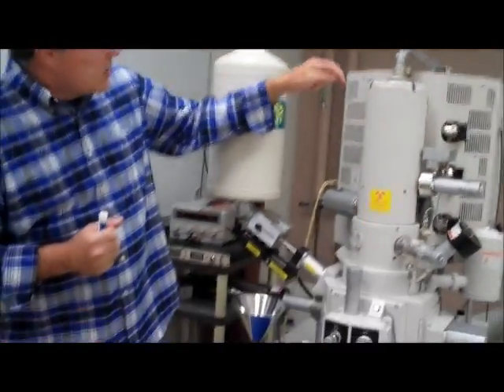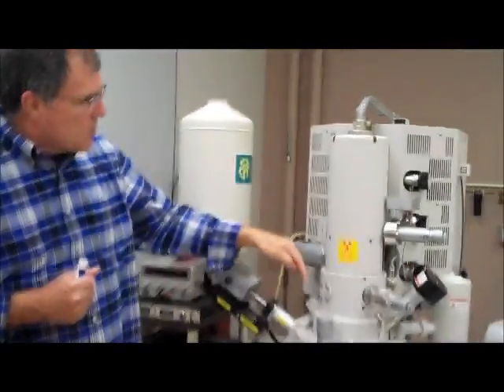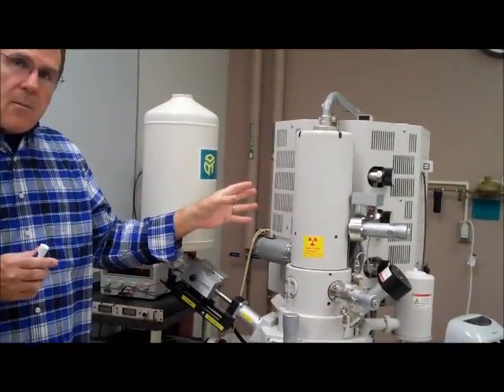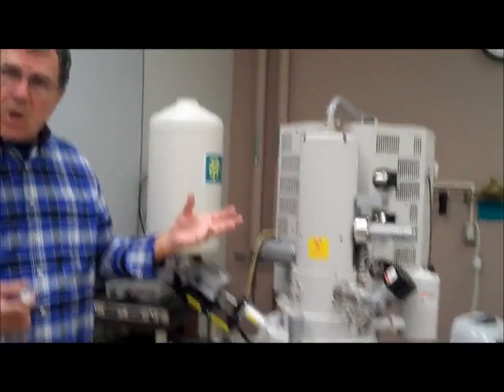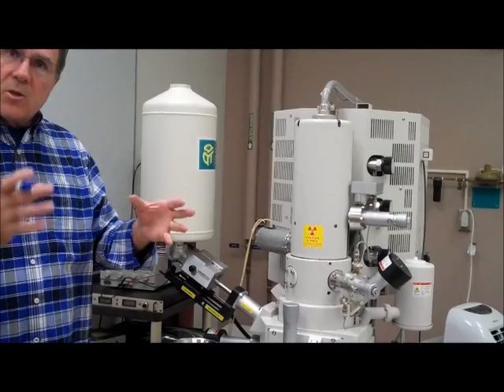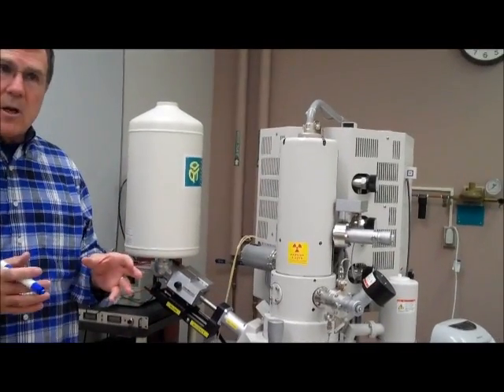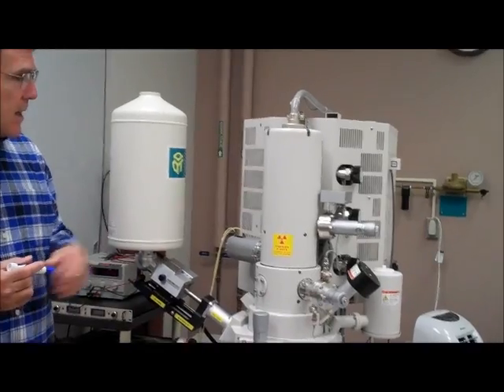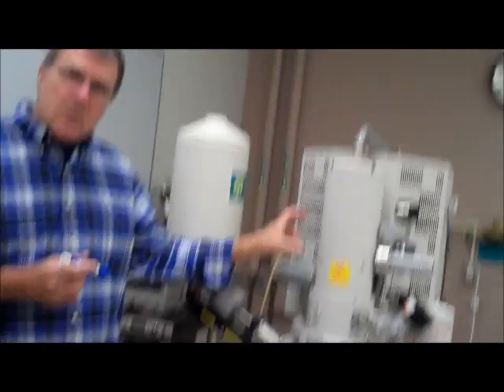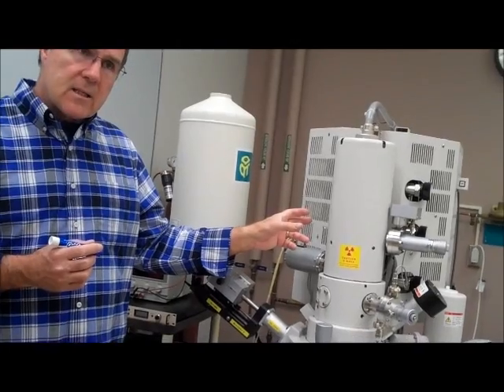So the electrons are accelerated down through the column, and along the way they pass through lenses, so just like an optical microscope would be used, you use lenses to focus and defocus the electron beam, or the light in an optical microscope. And the electron microscope, instead of using glass, we use electromagnets.